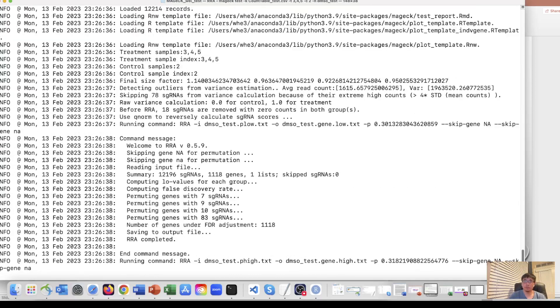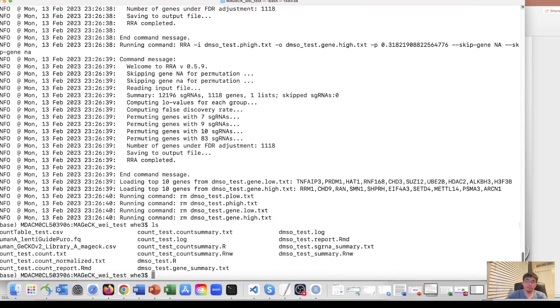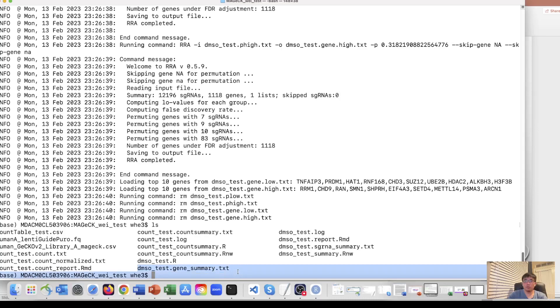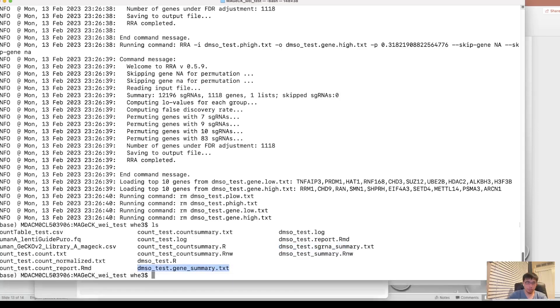It's running. And after running, we can get a file. So we call the DMSO gene summary. So this is the most important file we need. So it also has a report at sgRNA level, but the most concerning, the relative one is this one. Let's open it and see what's here.